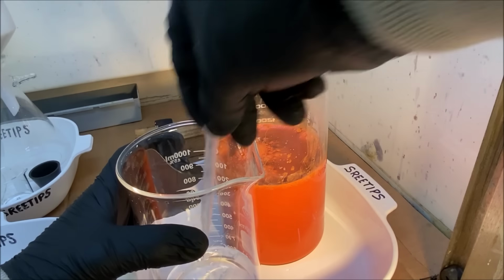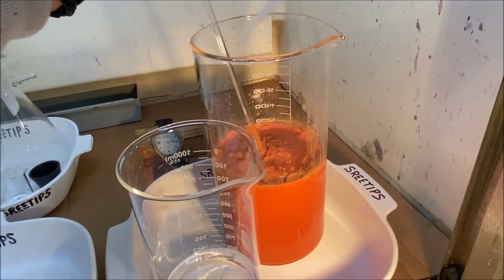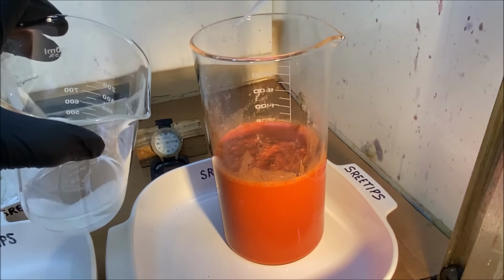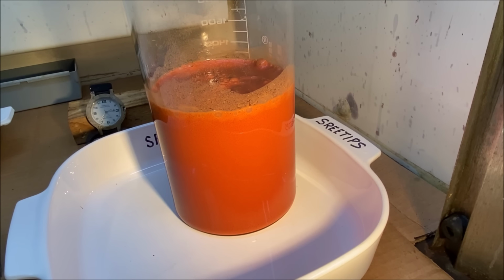Our ammonium chloride. I'm going to rinse down the stirring rod and the inside of the beaker now with some ammonium chloride. Starting to settle out a little bit. I'm going to put this on time lapse and just let it go.